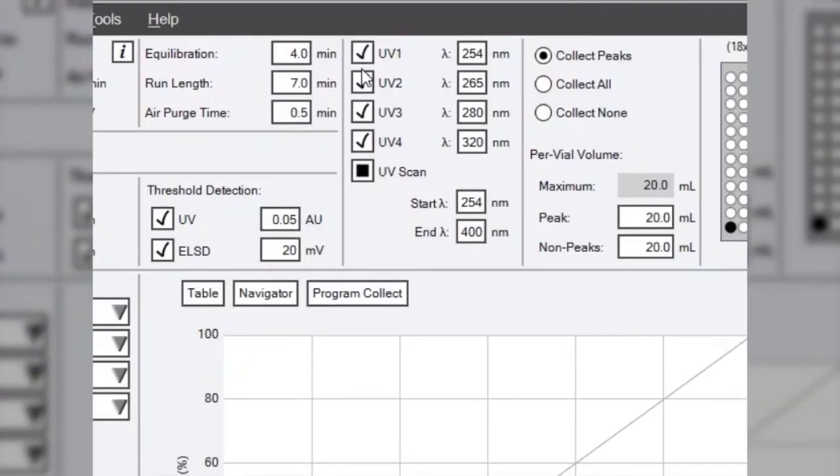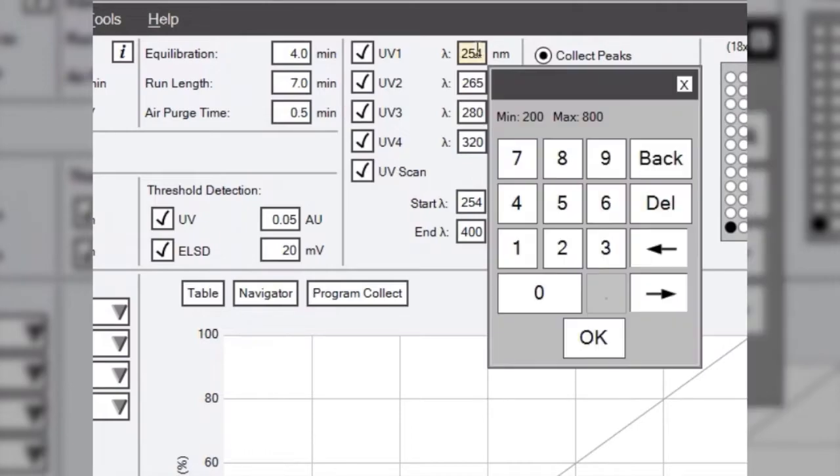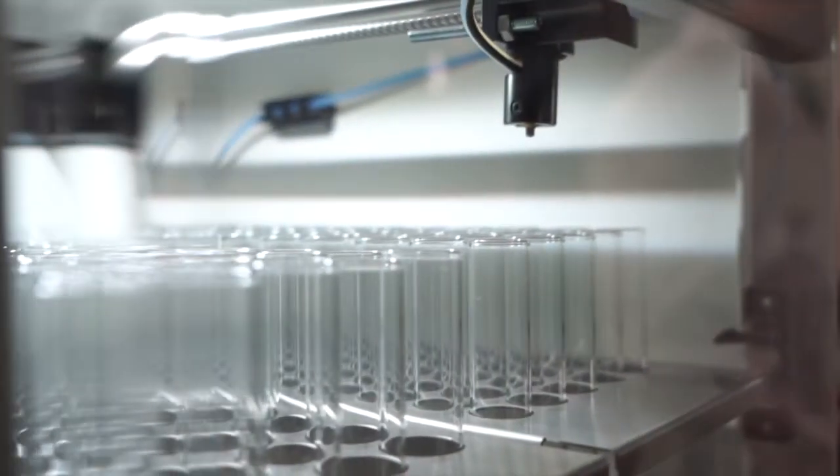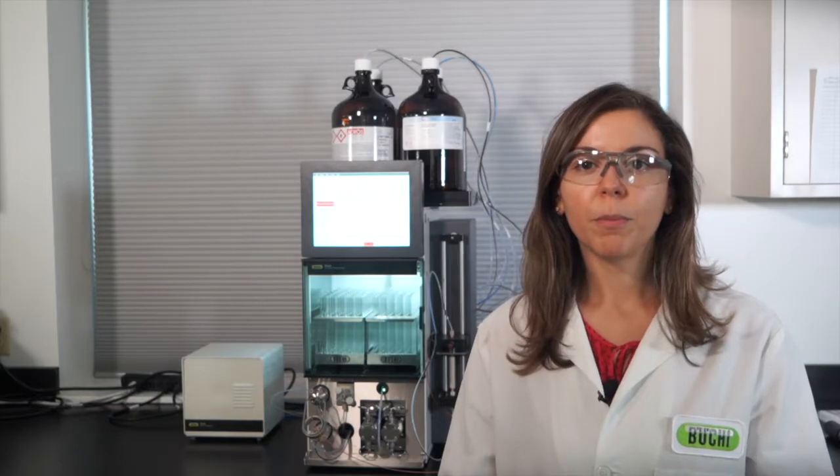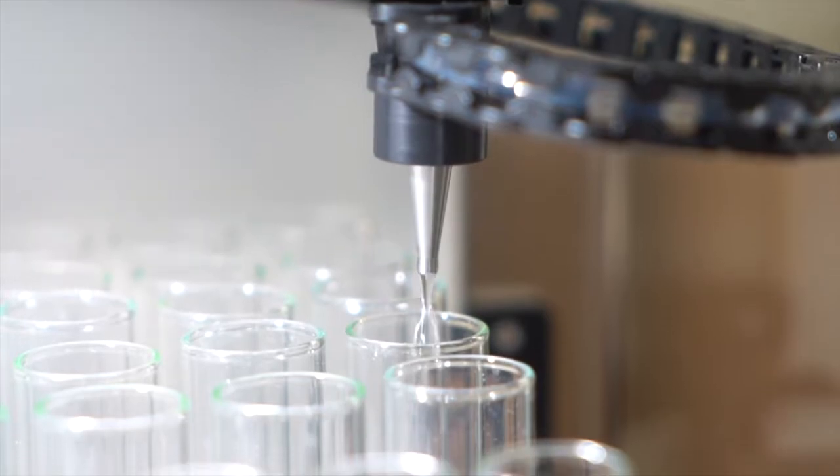The UV-vis detector allows strict collection based on up to four different wavelengths. The UV scan, also known as photodiode array, will measure the full range of detector and can either monitor all wavelengths or also be used to trigger sample collection. The sensitivity of the UV-vis and ELSD may be adjusted, more sensitive to improved recovery or less sensitive to improved separation. If you only want to collect fractions based on one detector, you may uncheck one of the detectors to either monitor or off.